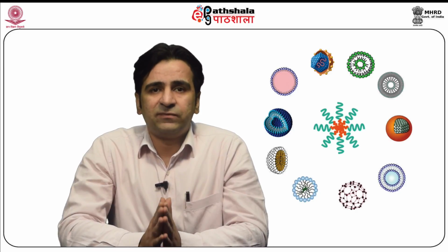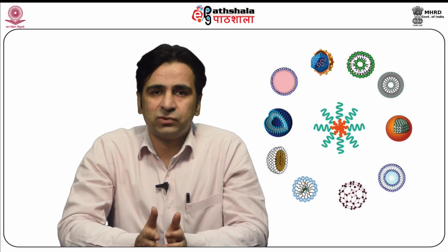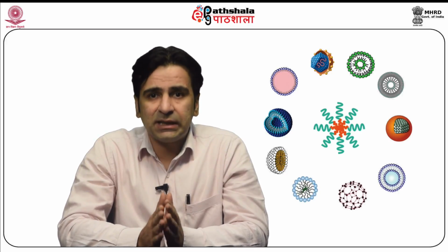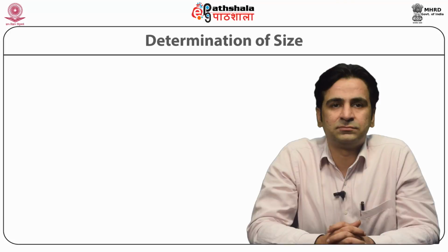Next is atomic force microscopy. It is used to study the size and morphology of the liposome. AFM also provides information about the aggregation process that might take place in the liposomal preparation during their storage.